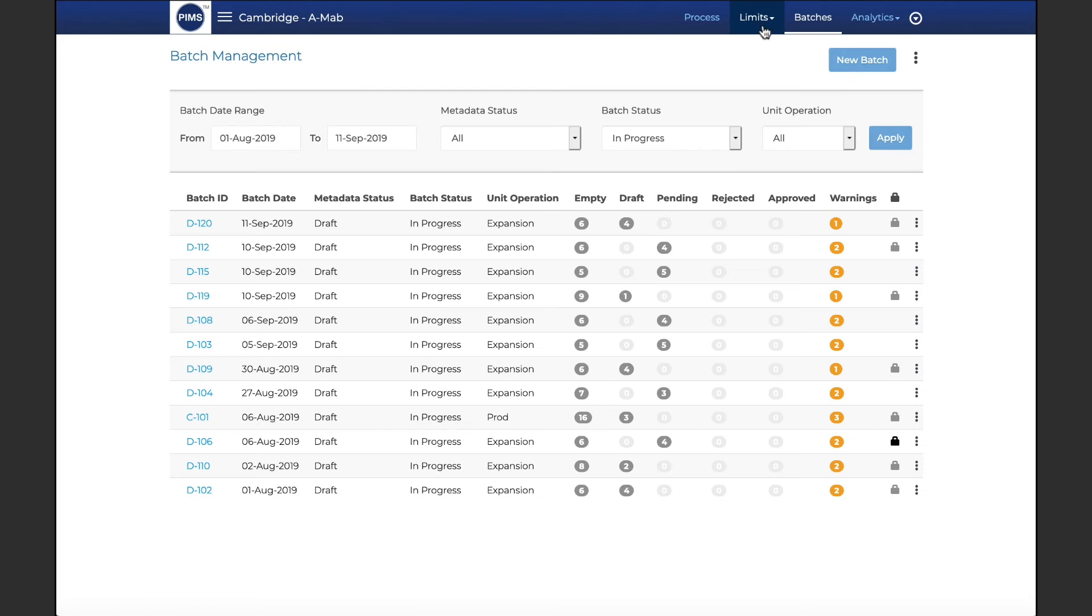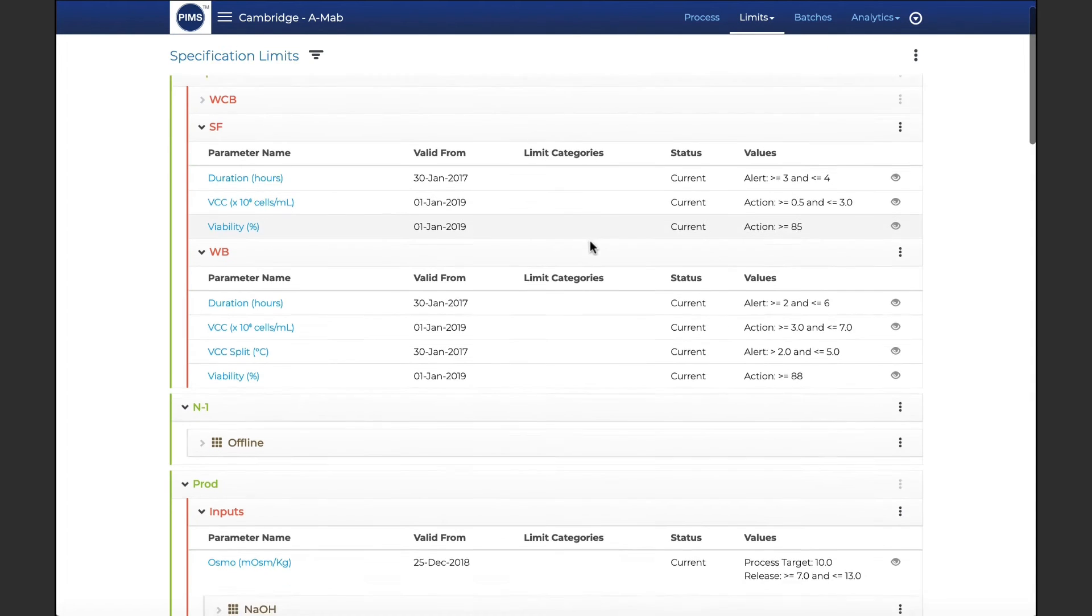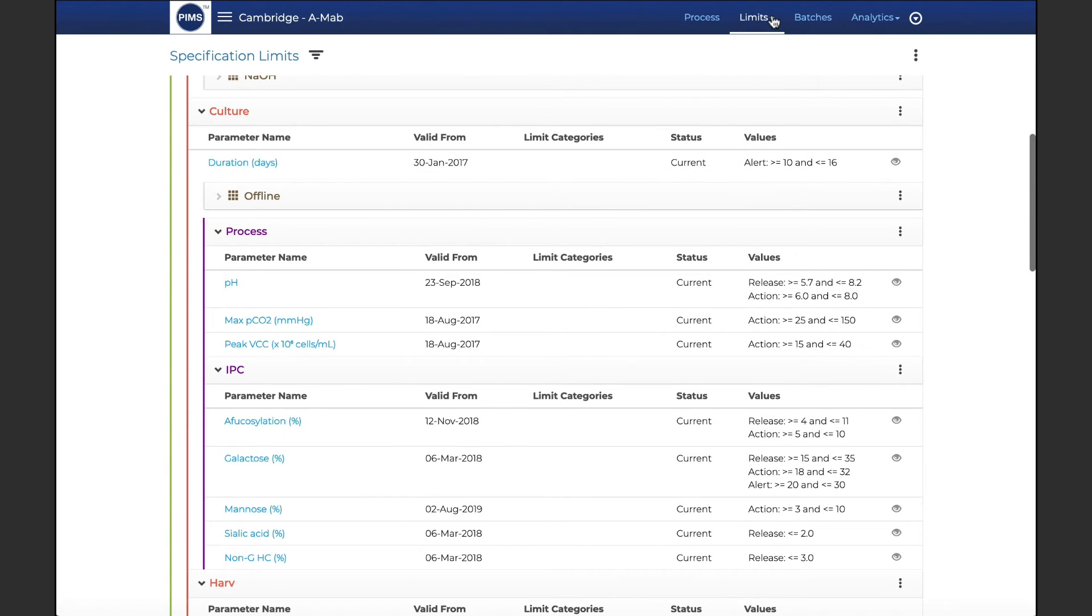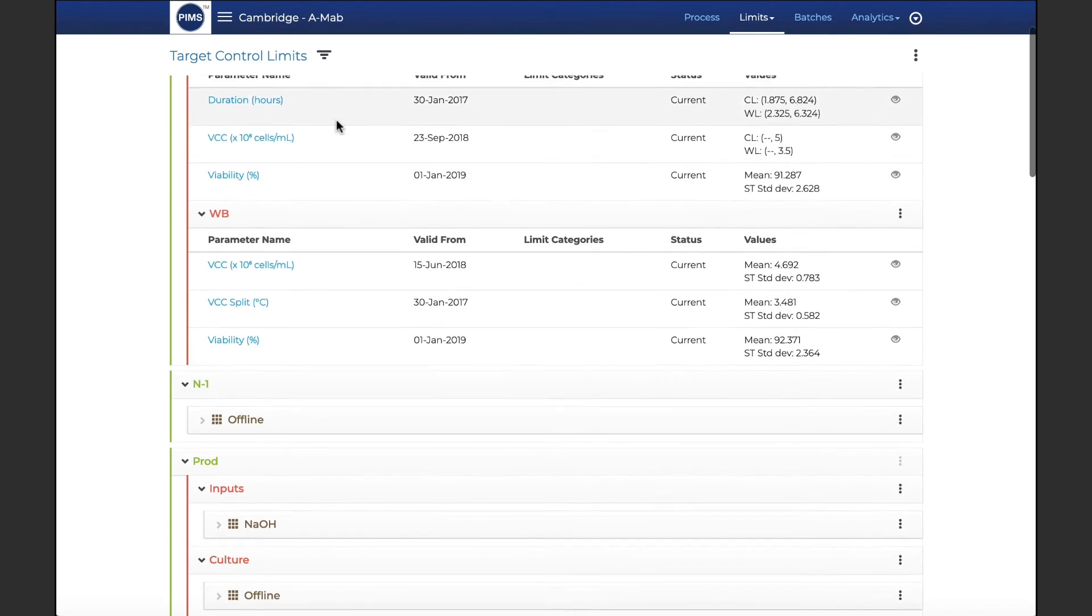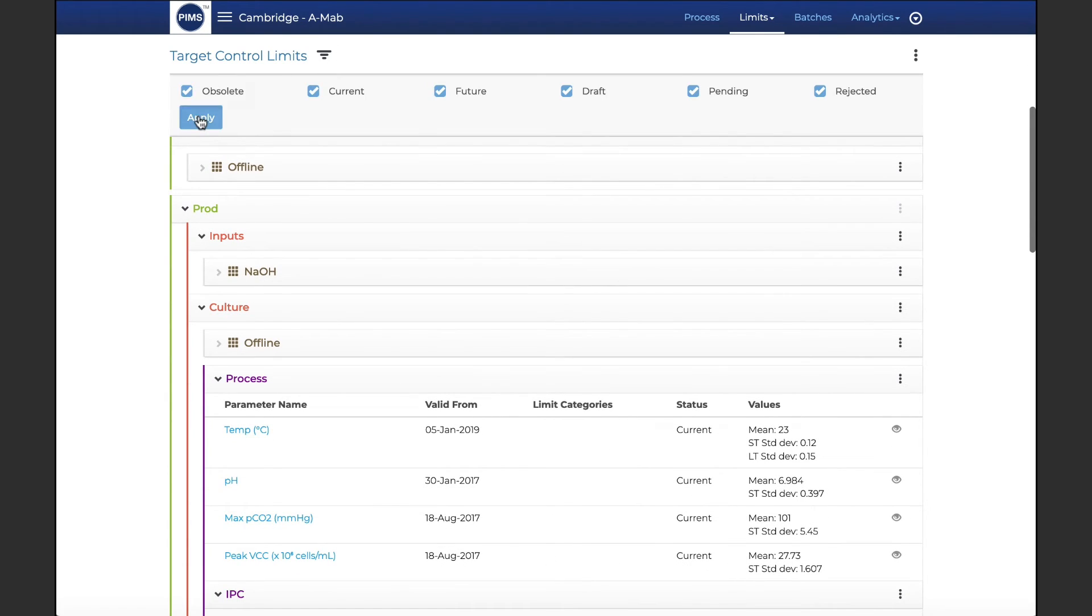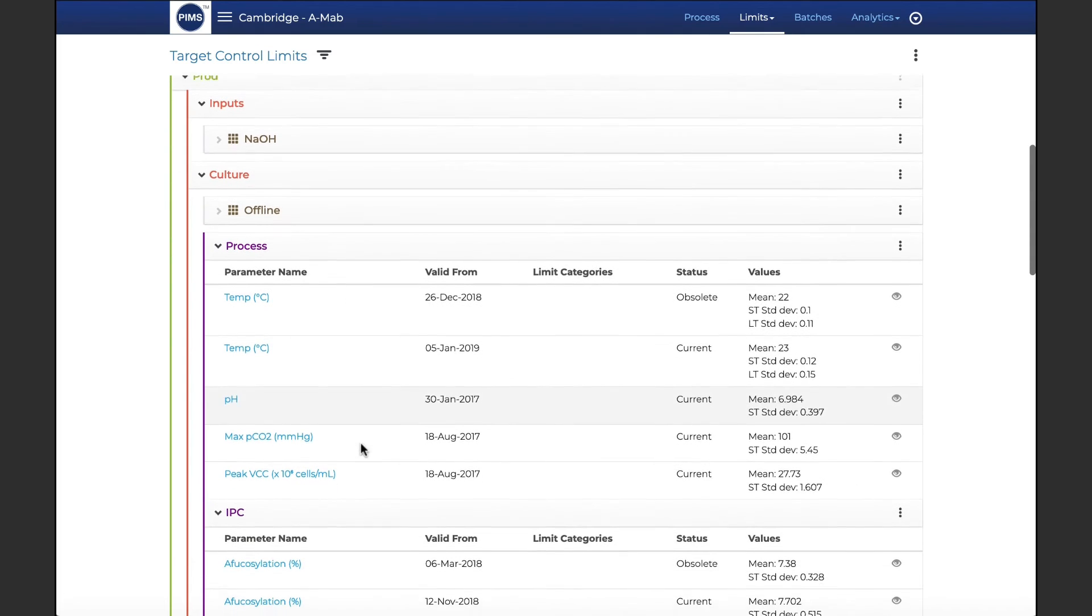PIMS limits enables management of specification and target control limits, which may be defined for all applicable parameters, and each parameter may have multiple versions based on a combination of valid data ranges, sub-products, or markets.